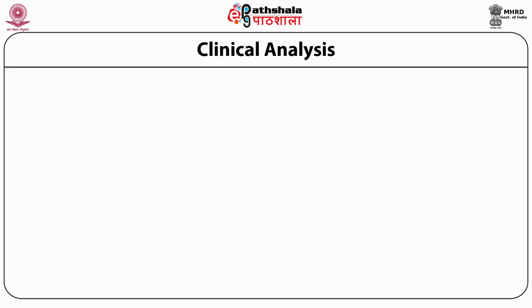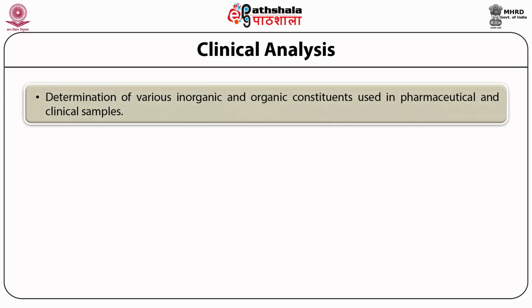IEC provides aid in determining various organic and inorganic constituents in clinical samples.